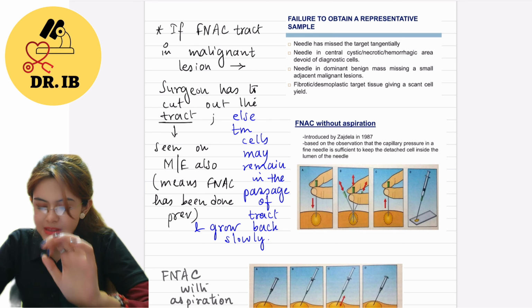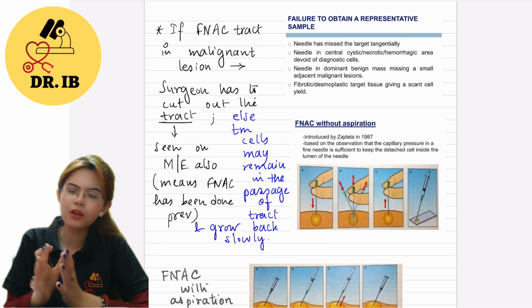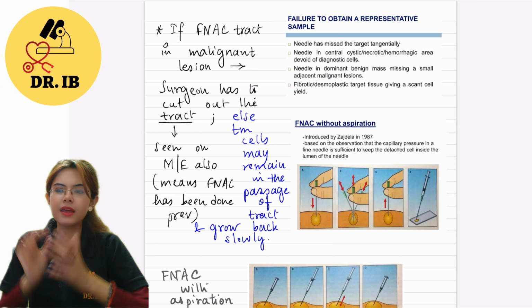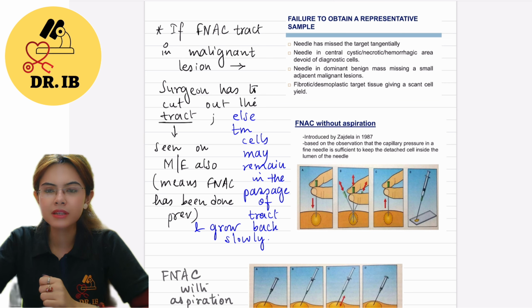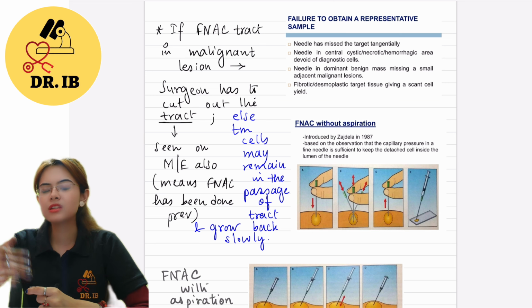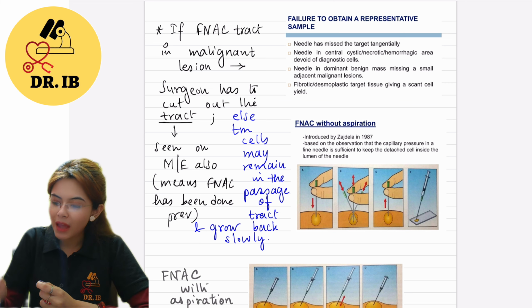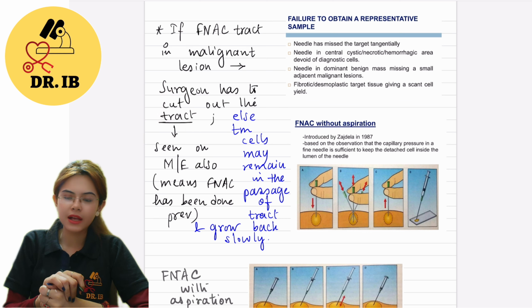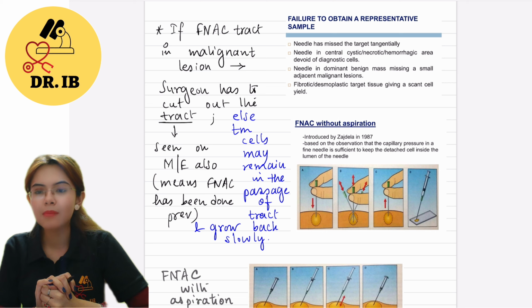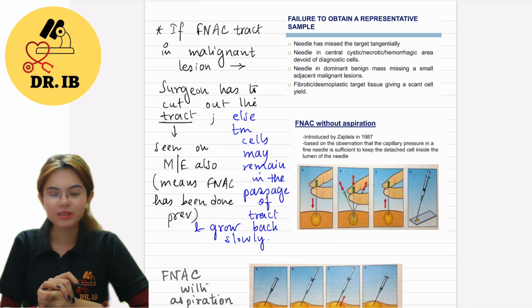And please understand that on the resected specimen, मान लो कि एक थायराइड का स्पेसिमेन आया है, मतलब एक पेशेंट आया है बेसिकली. So once you are doing the FNAC, that has come out to be malignant, and now this patient had undergone hemithyroidectomy, and once you've got this specimen, you will be able to see this tract, क्योंकि आपने खुद बनाया था, है ना? तो वो ट्रैक्ट आपको दिखेगा, वो माइक्रोस्कोपी में वो ट्रैक्ट आपको दिखेगा. मतलब वो आपको समझ में आना चाहिए कि यहाँ पे FNAC हुआ था पहले. समझ रहे हो? तो यही है थोड़ा बहुत एक्स्ट्रा पॉइंट्स जो मैं बताने की कोशिश कर रही हूँ.